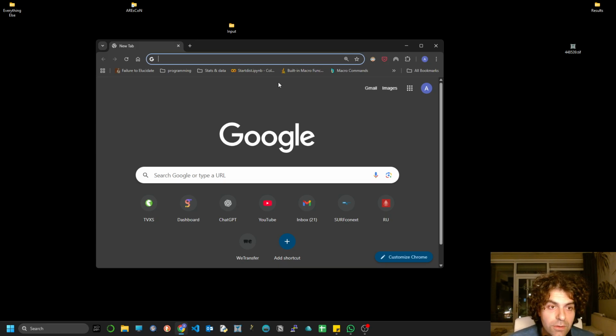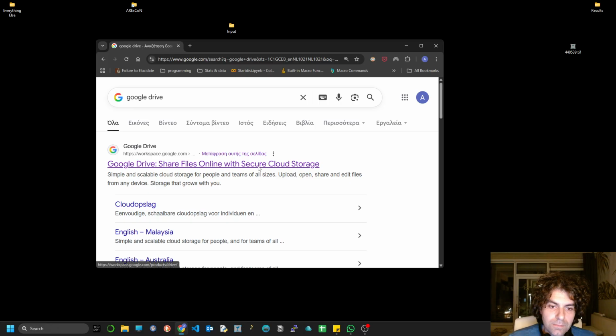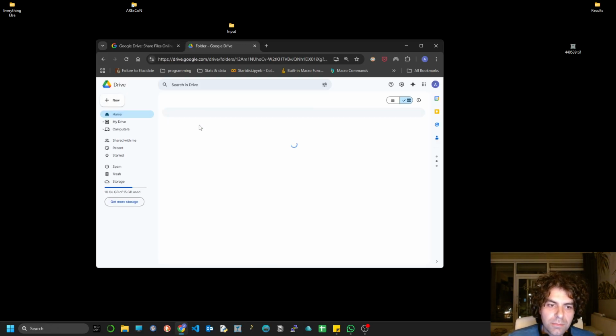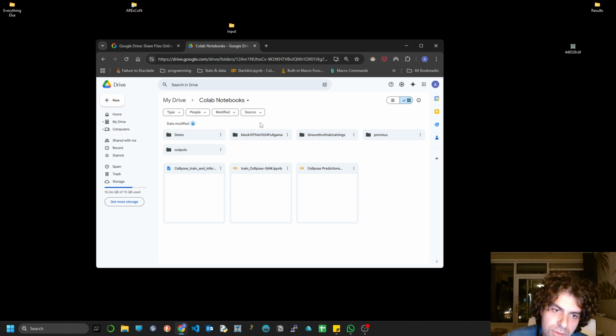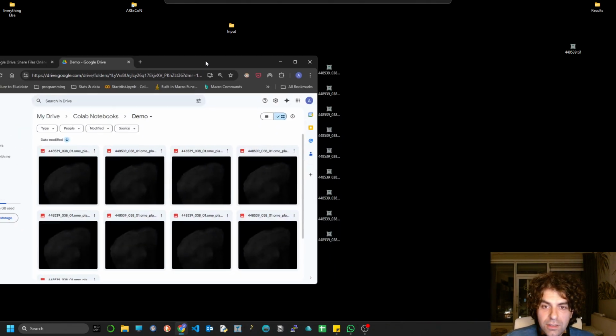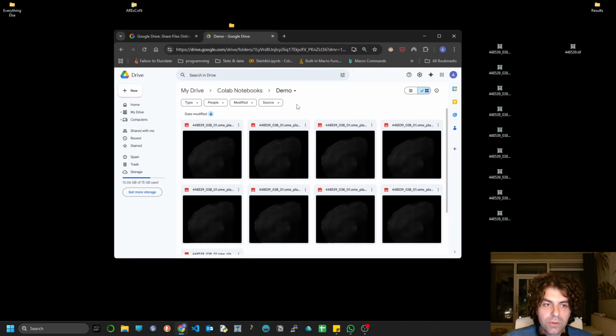What I'm doing right now is logging into my Google Drive and accessing a folder called Colab Notebooks, and in the demo I've inserted all of these images. I've uploaded them already.